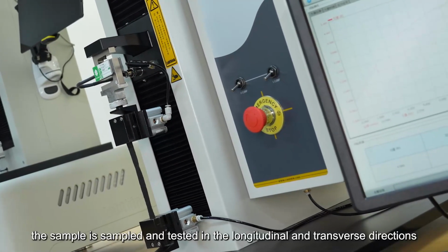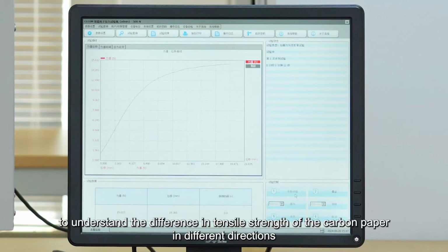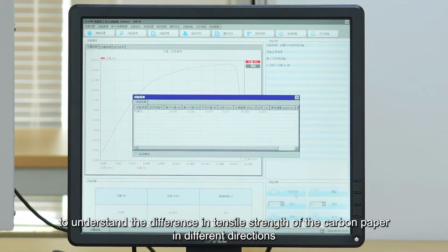If necessary, the sample is cut and tested in the longitudinal and transverse directions to understand the difference in tensile strength of the carbon paper in different directions.